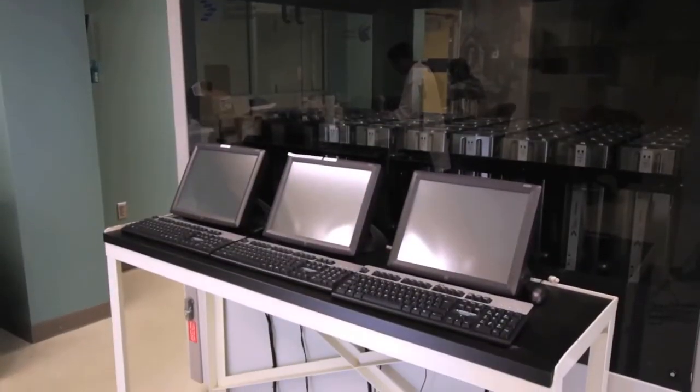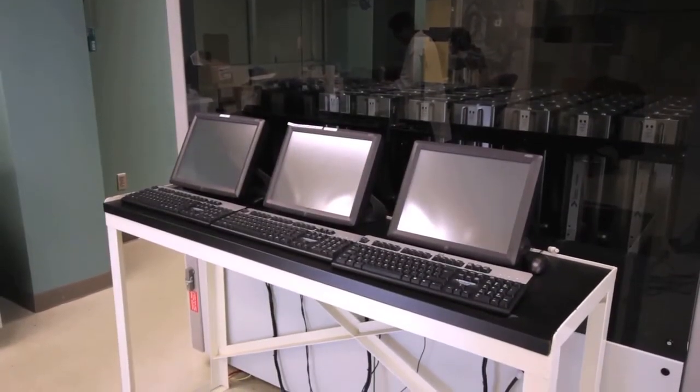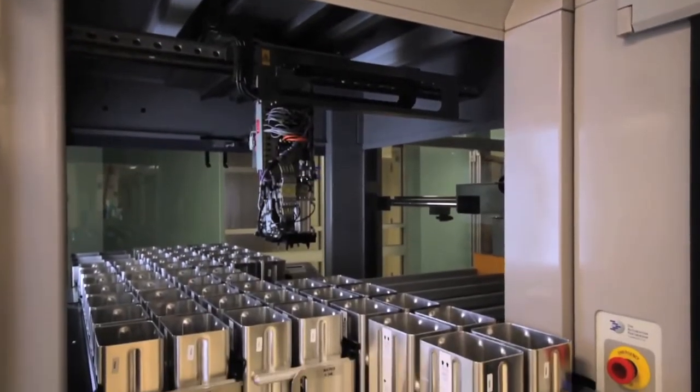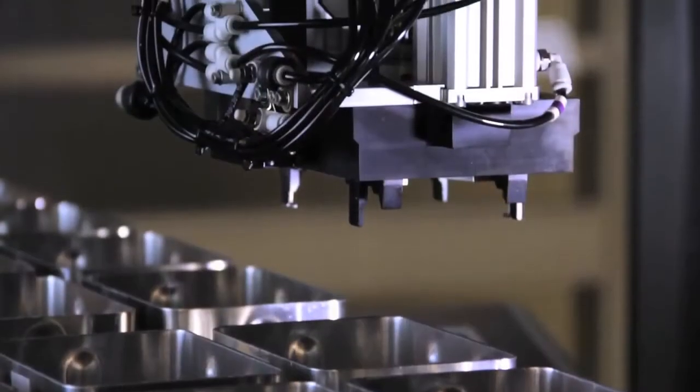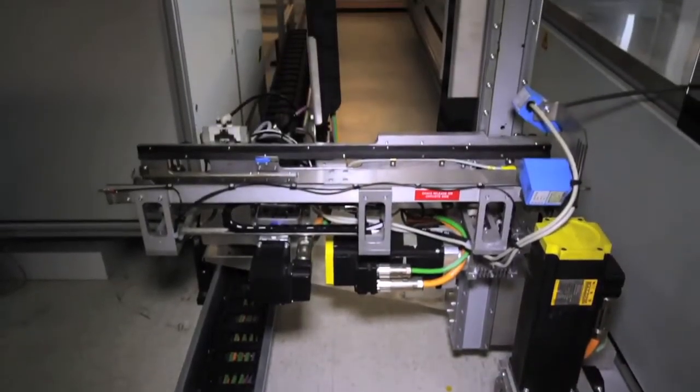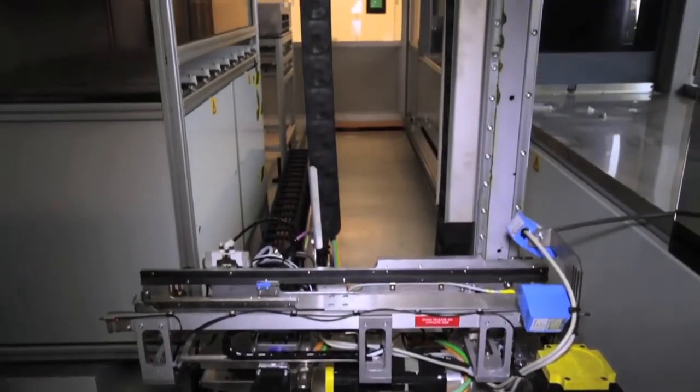The system has three data entry stations for sample information input. Microplates are processed through the barcode reader and printer, where the sample is submitted, tagged and provided to the robot, which places the sample on the transfer belt and then transfers it into the proper storage location.